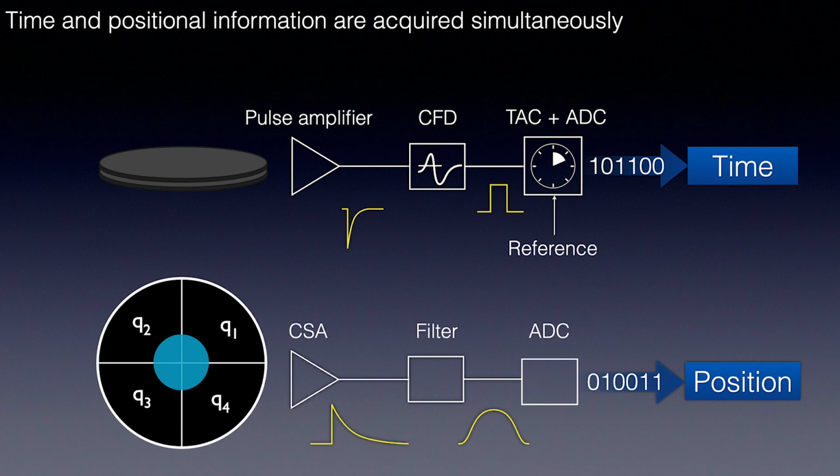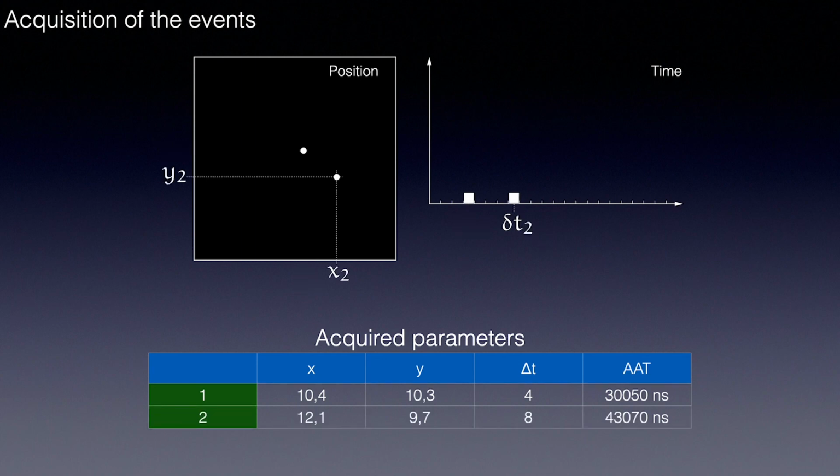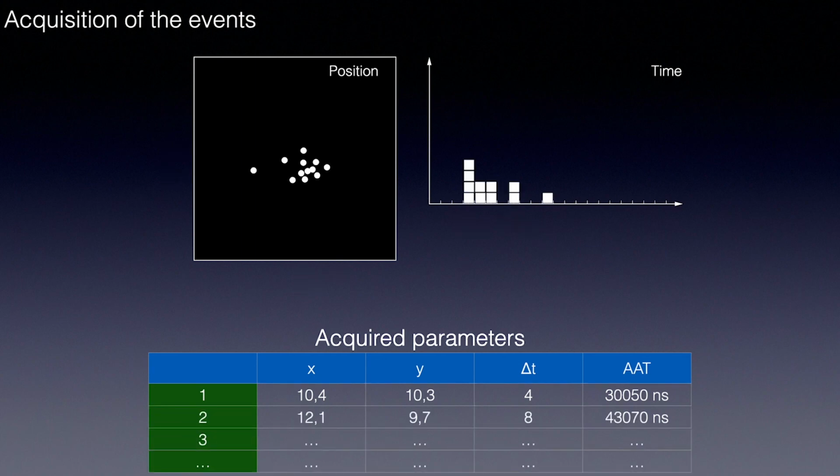So how does this allow us to get images whilst having no pixels? When we get a click, what we do is we add such a single line into a table. As data fields, we have X and Y positions. We have picosecond timing, delta t, and the absolute arrival time of the photon. With the next photon, we just append another entry, and another, and another.